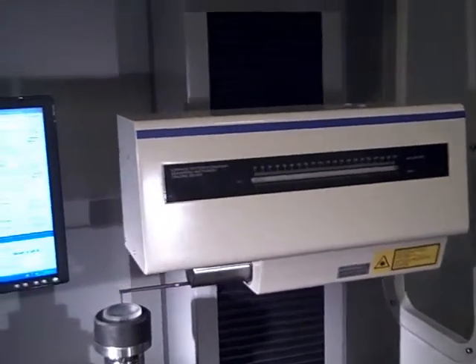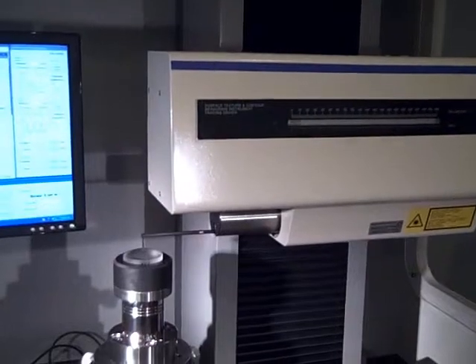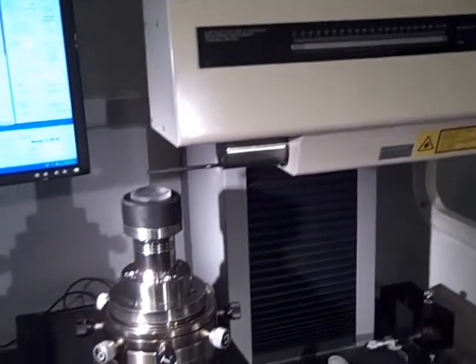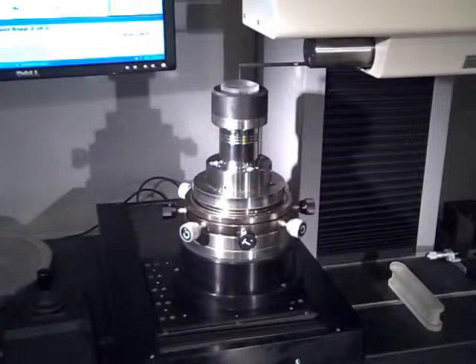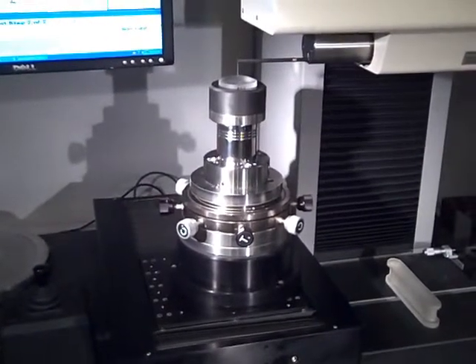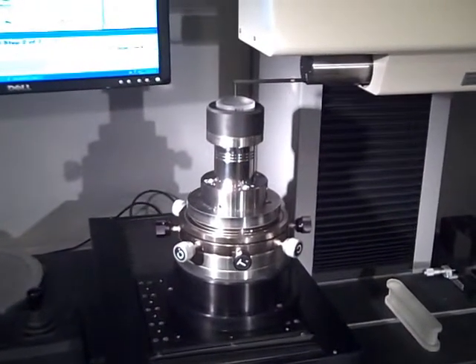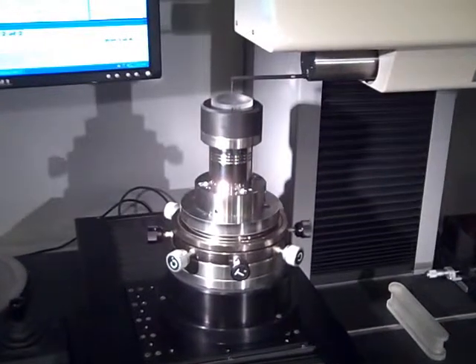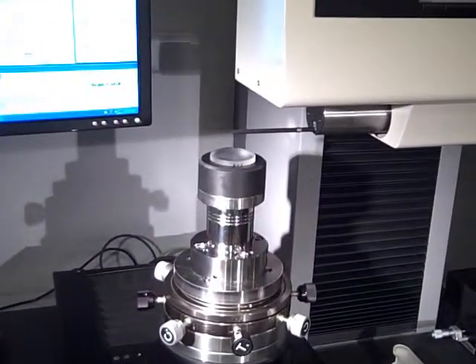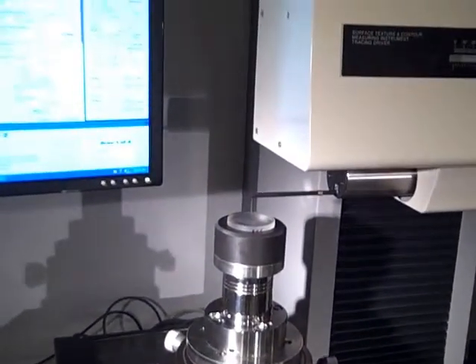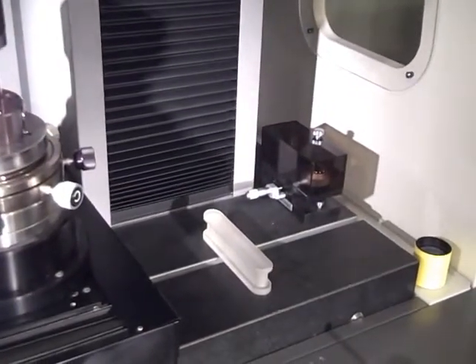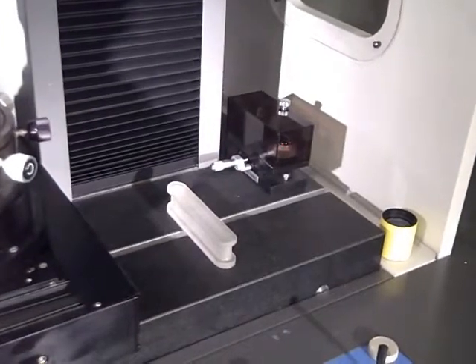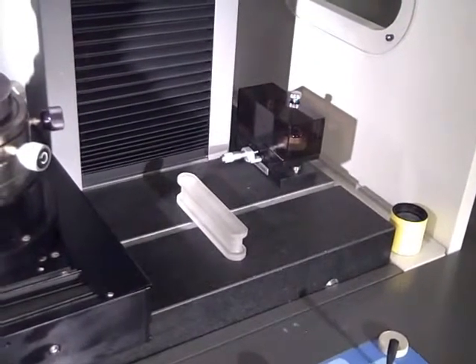We have 2 micron diamond styli as well as 1mm ball styli. The Y-theta interface is linear air bearing and rotary air bearings for measuring A-spheres. They are motorized and can be controlled for measuring multiple scans on an A-spheric profile as well as workpieces as A-spheric cylinders and different toroidal shapes.